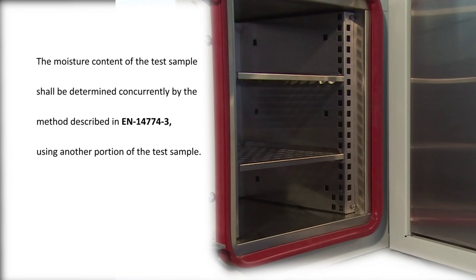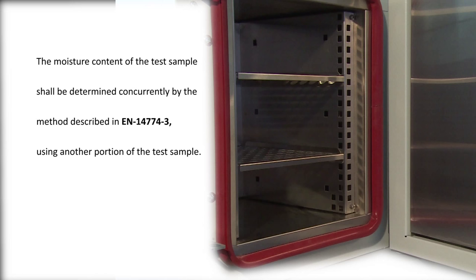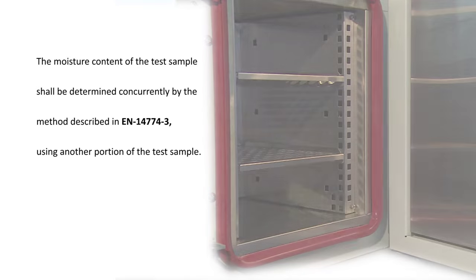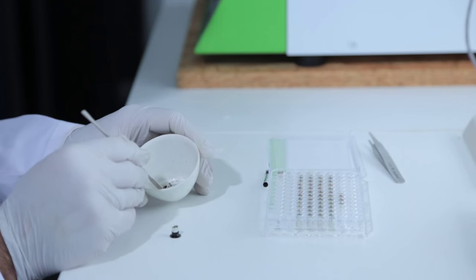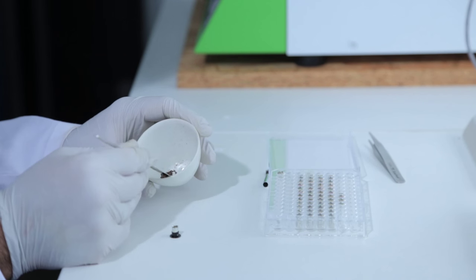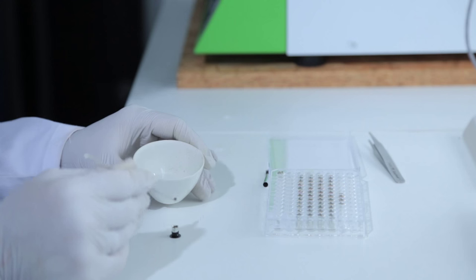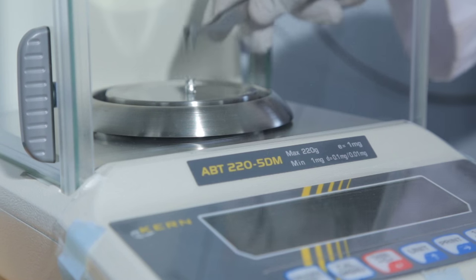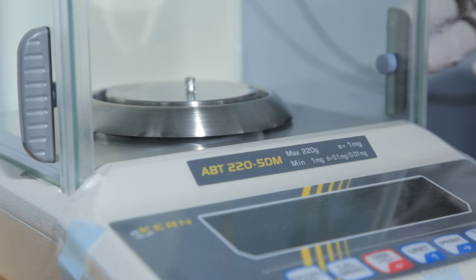The moisture content of the test sample shall be determined concurrently by the method described in EN-14774-3 using another portion of the test sample. Weigh to the nearest 0.1% relative 1.5 to 2.5 milligrams of the test sample. The test portion shall be weighed directly into the sample.